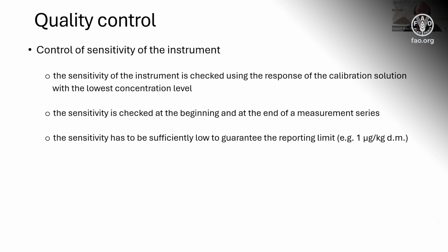And is this taking into consideration that different methods may have been used in this round-robin test, or would you say this is when everybody is using more or less the same Soxhlet extraction and determination method? Now, for international interlaboratory tests, every country has its own methods, so we have different methods. So the reproducibility will be a little bit higher.